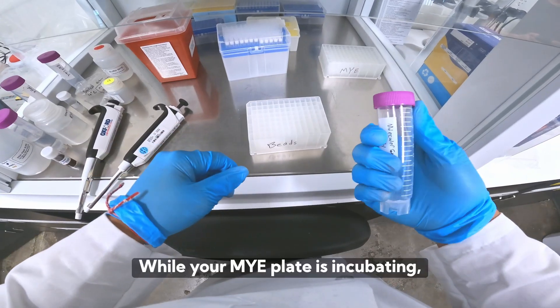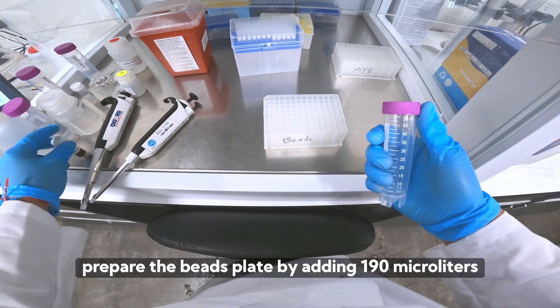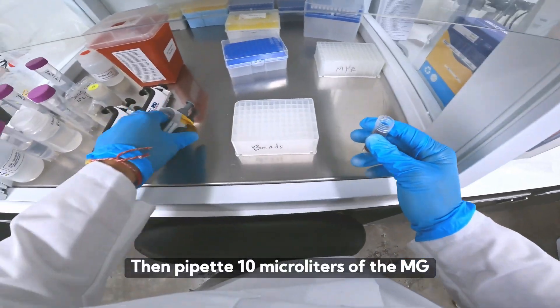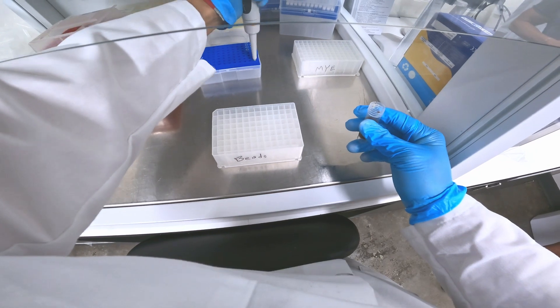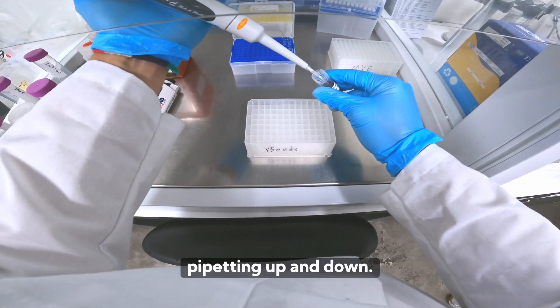While your MYE plate is incubating, prepare the beads plate by adding 190 microliters of water to each well. Then pipette 10 microliters of the MGPure beads into each well of your beads plate. Ensure that the beads are well mixed by pipetting up and down.